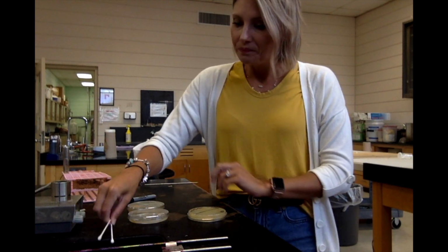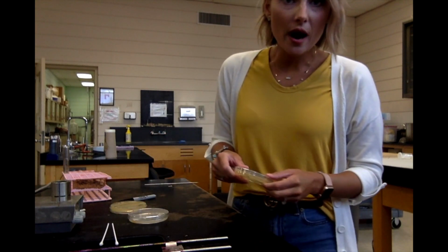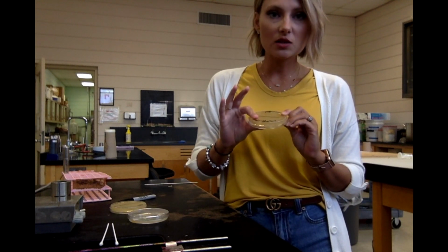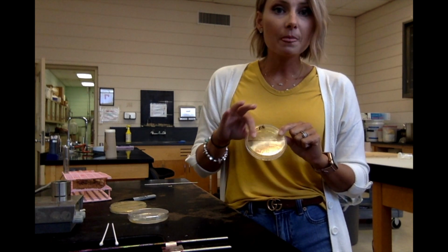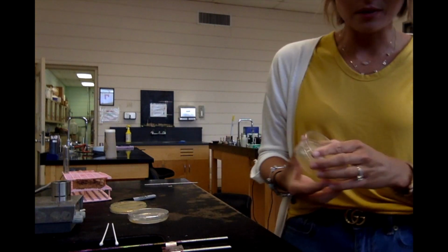Okay, so I swabbed a plate and I put it in the incubator for 24 hours for it to grow up, and these are the results that I got from my PCA plate. So I did the bottom of my shoe and then I did the water fountain. Pretty much everyone's bottom of their shoes, unless they work in a hospital, are going to give about the same results, because we're all walking in the same areas.